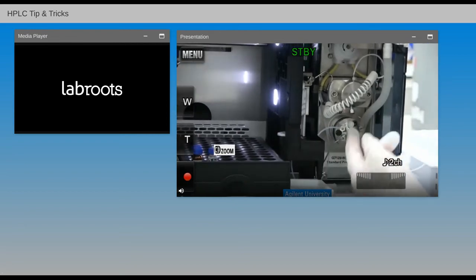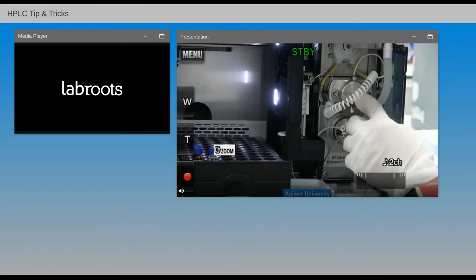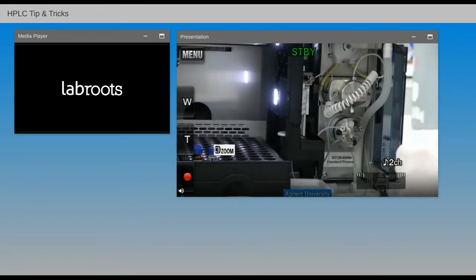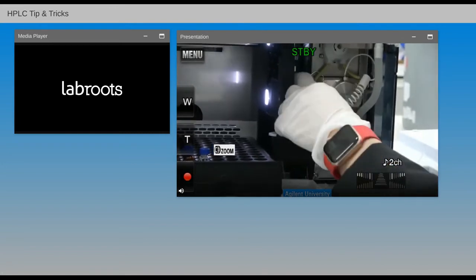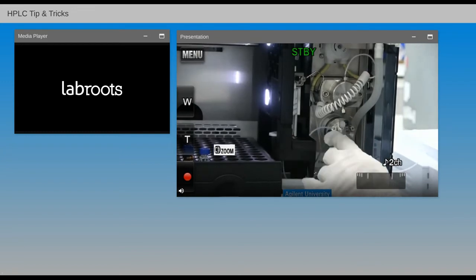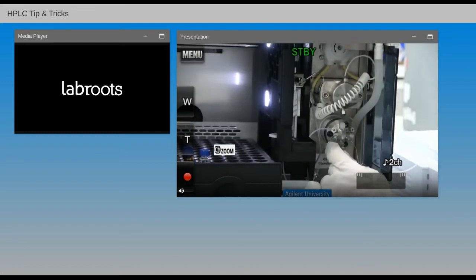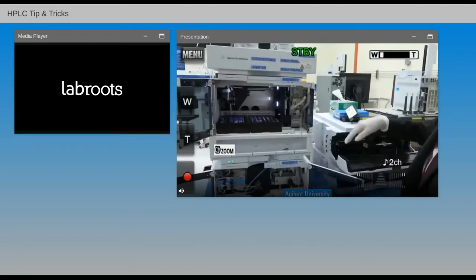They will flow through the rotor seal and then come out and go to this metering device, where they control the amount of sample being drawn for the needle. And then the solvent will pass through the needle seat capillary back to the injection valve, and then it will switch to this point here to have the solvent flow into the column.